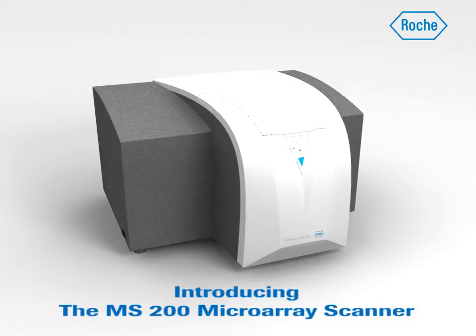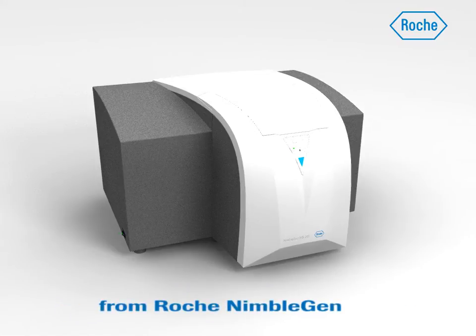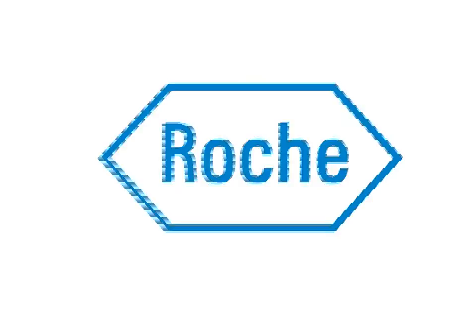Insist on the NimbleGen MS200 microarray scanner to unleash the full potential of NimbleGen microarrays.